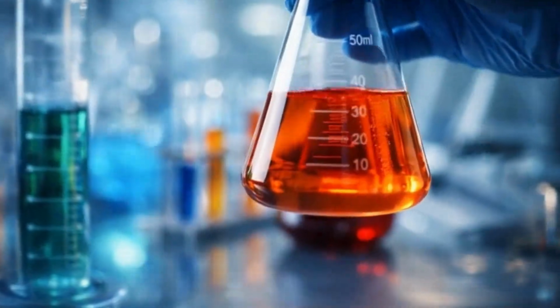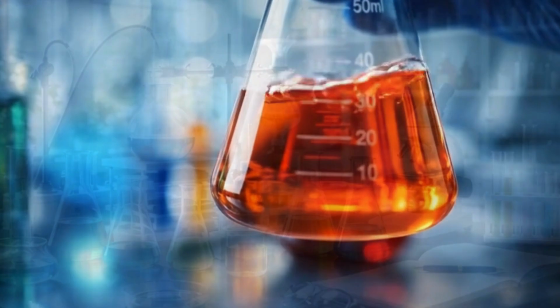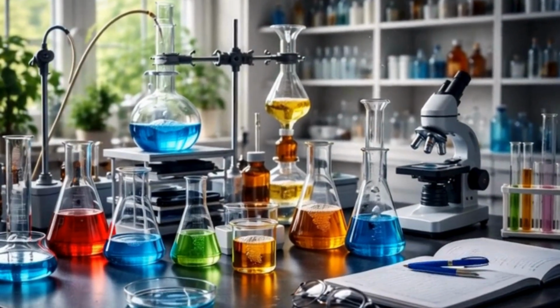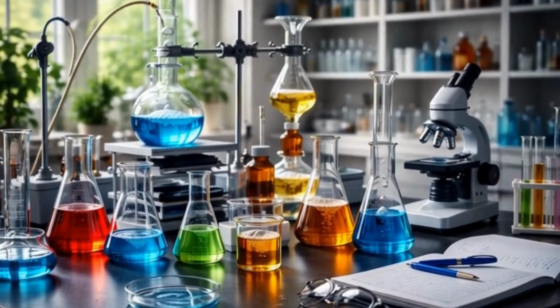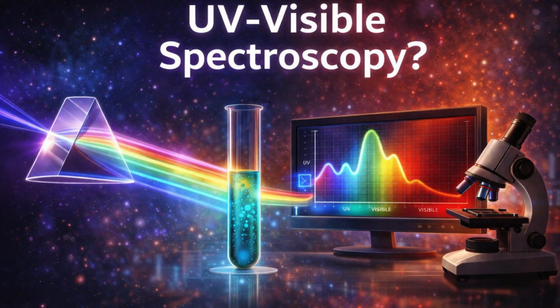concentration of a substance in just seconds, or how they identify unknown compounds without touching them. The secret lies in one of the most powerful yet elegant instruments in chemistry, the UV visible spectrophotometer.